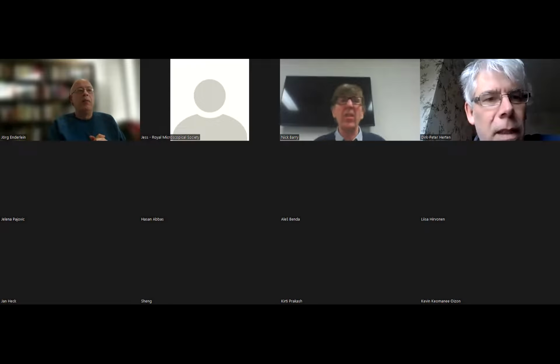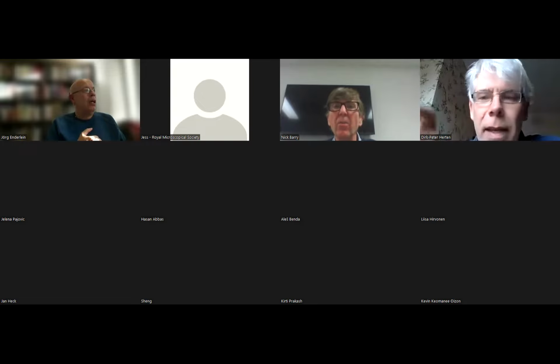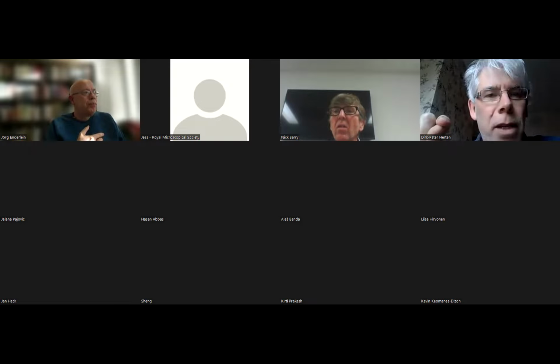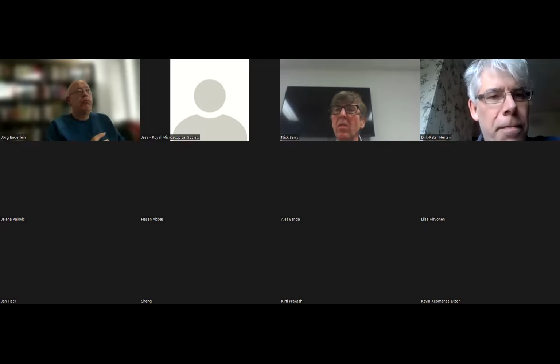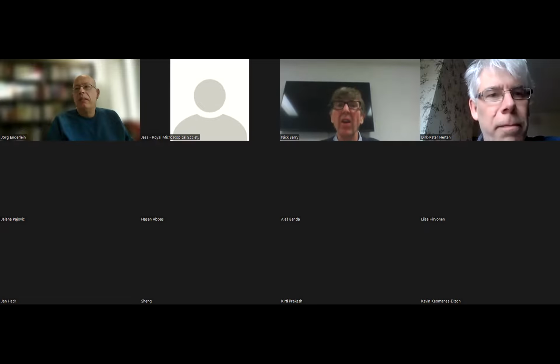And may I just add, because I'm not sure the first part of the question was really understood. My question was actually, how long does the recording of a whole STORM image basically take for you? Oh, okay, yeah, long. Good question. I think for the chromatin, in the order of 30 minutes. Okay, 30 minutes. But that is very rough.